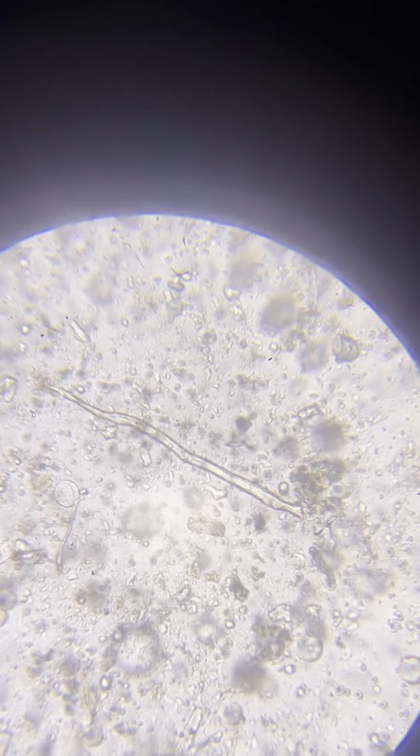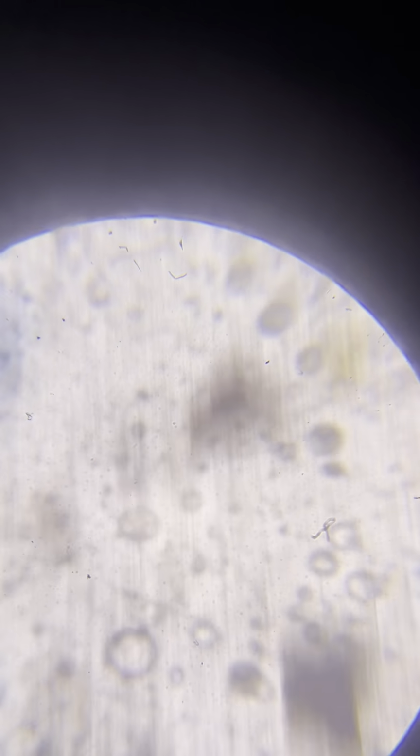This is nice. I mean, we see nice things. I can't say that I understand what I see. I do see a tremendous amount of neurons, but in small to medium size. On our scale, they might all be huge compared to what you know from, I don't know, the body of the females. But on our scale, they are all small to medium, in tremendous quantity, but we don't see bigger ones.